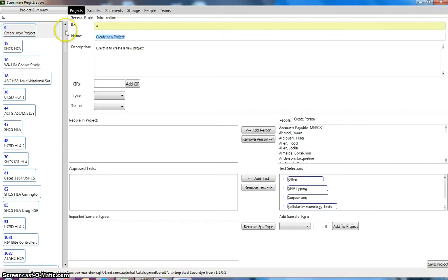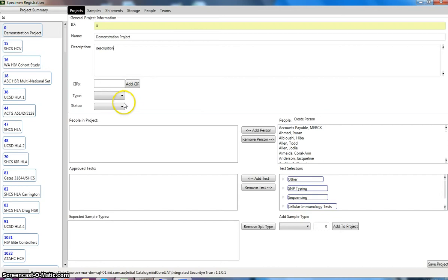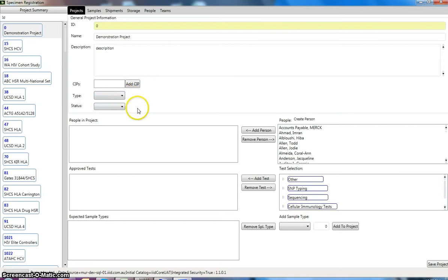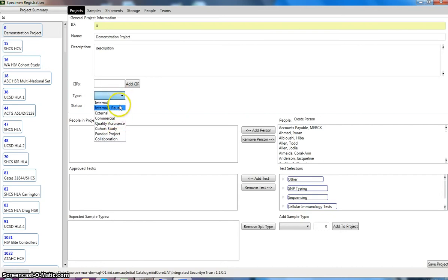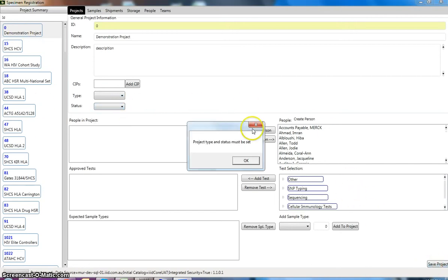For demonstration purposes we can put in demonstration project. You can put in any description that you like. And so we need to choose a type and a status for our projects as well. So we've got a set of predefined types that we can choose from and statuses. If we forget to put those in and click on save project you can see that project type and status must be set.